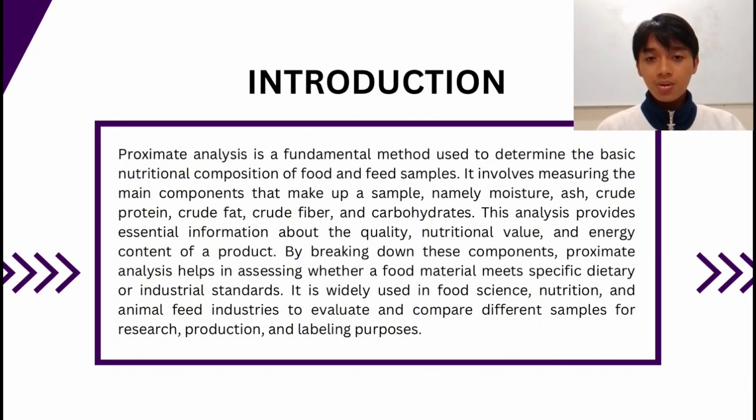It's essentially how we break down a sample into its major nutritional components like moisture, ash, protein, fat, and carbohydrates. We need this breakdown because it gives us the essential information required to calculate the product's nutritional value and, crucially, its energy content, which we then compare to the label.